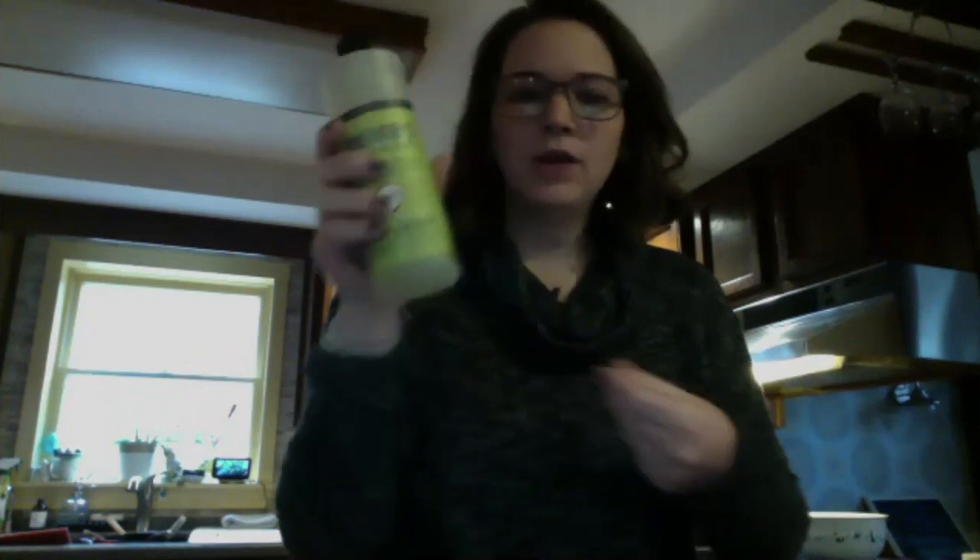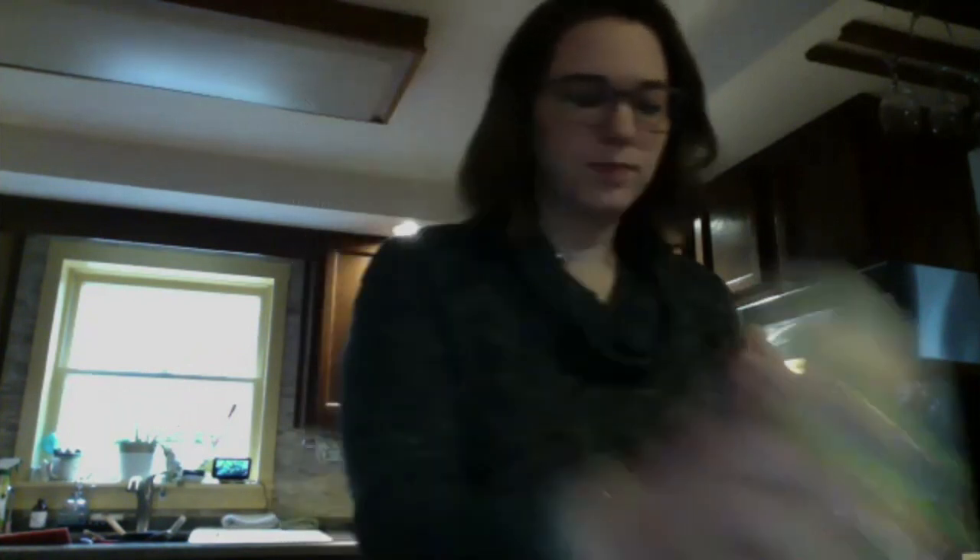So now it says you're going to add two tablespoons of liquid detergent and swirl to mix. I'm going to use dish soap. You can use any dish soap, or actually laundry detergent.